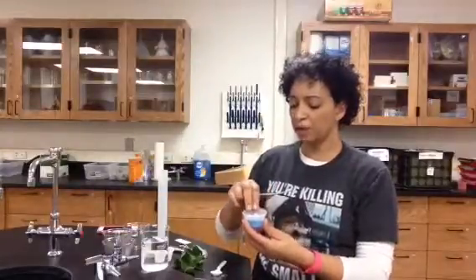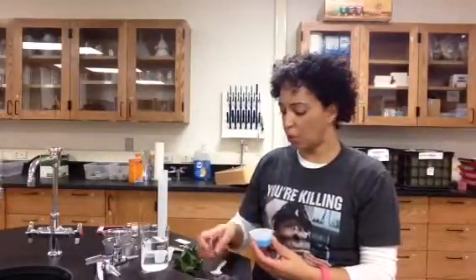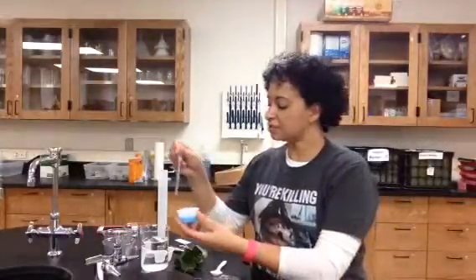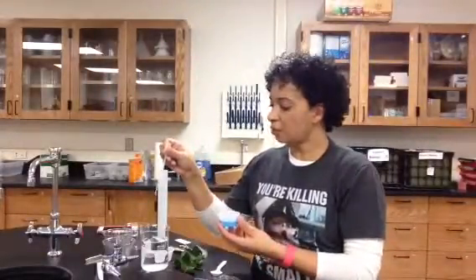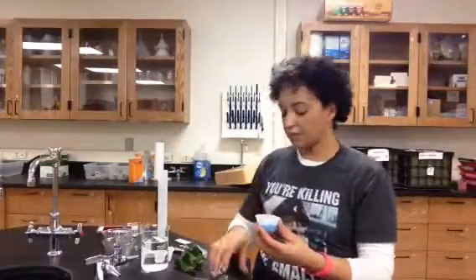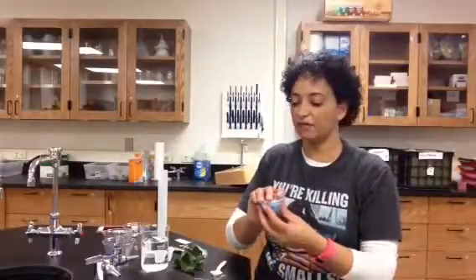Now, if you remember back to our biochemistry unit, we talked a lot about water and how water has surface tension. Well, we don't want the leaf chads to float on the top, so I'm going to add 1 drop of dish soap to my solution here so that my leaf chads have the ability to sink, so that they're not trapped by the water tension of the water. Okay, so soap's going to break that water tension.